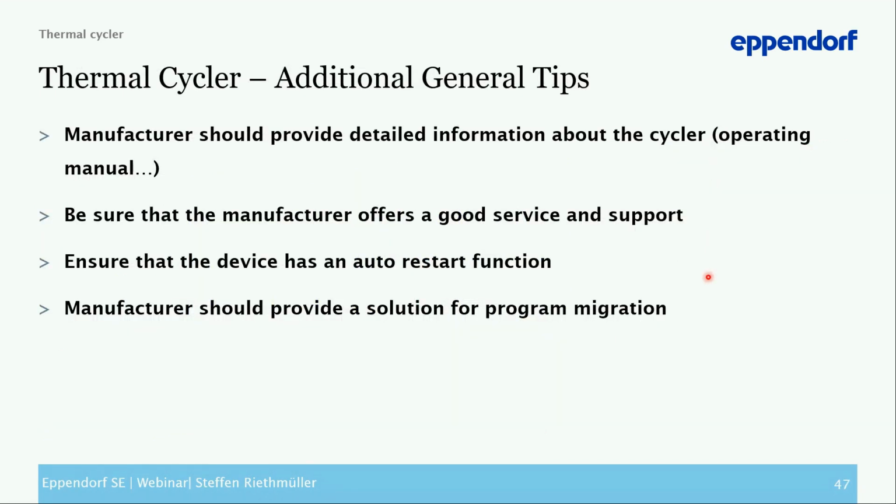Okay, just some additional general tips from my side. What is important for me is that the manufacturer offers detailed information about the device, so for instance, a comprehensive operating manual. For me, it's important that the manufacturer offers a good service and support. And a plus is also an auto restart function.